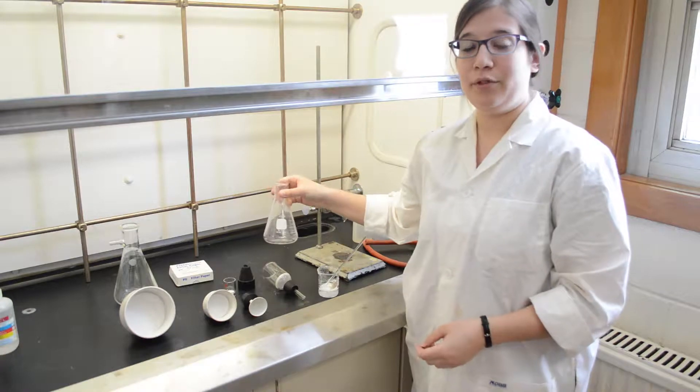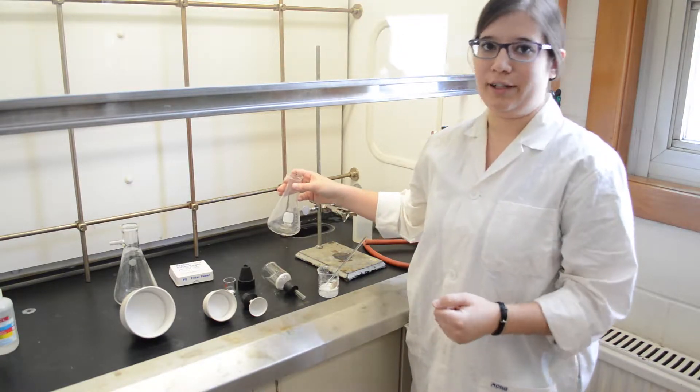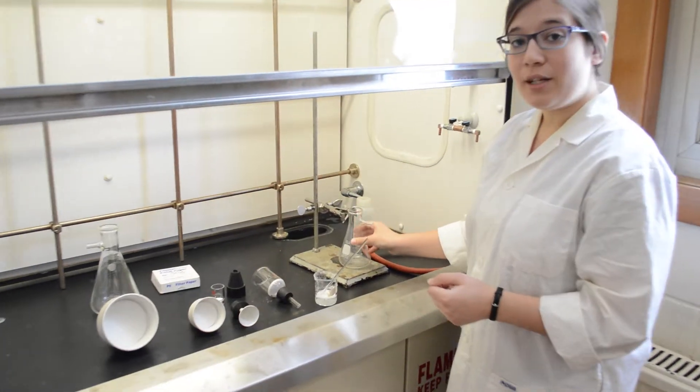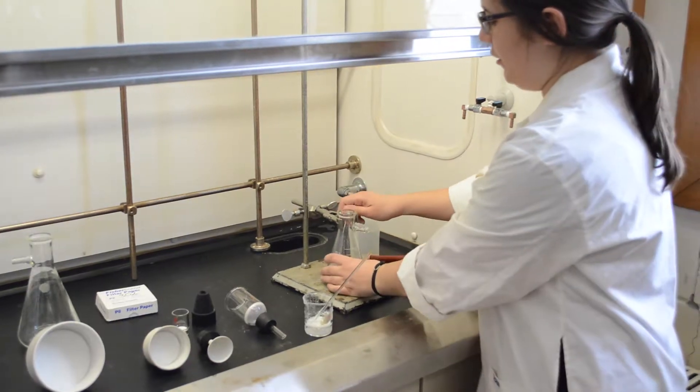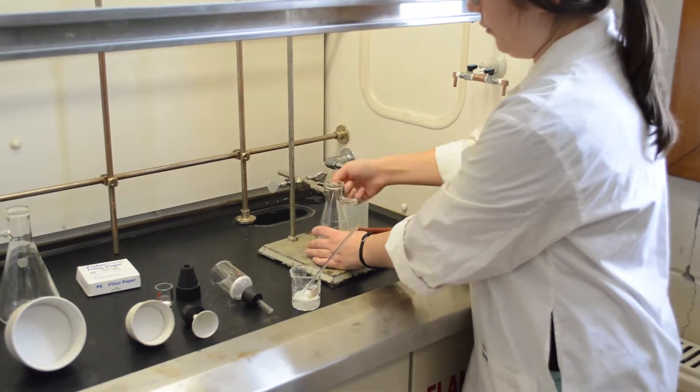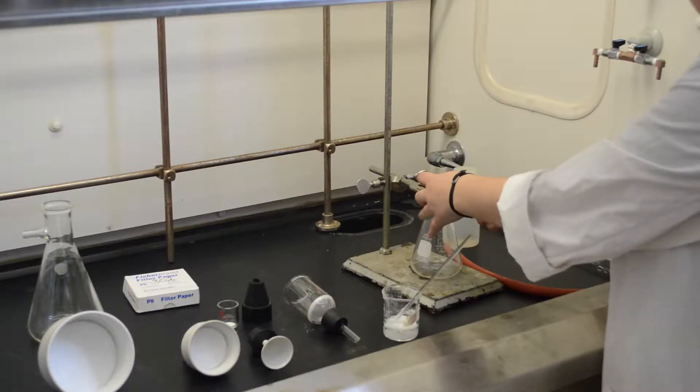I'm going to show an example of using a larger sintered glass funnel. The first step is always to clamp your filter flask to a retort stand. Then you have to attach the tubing.